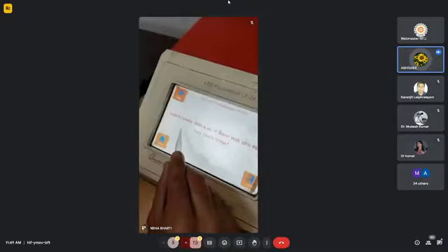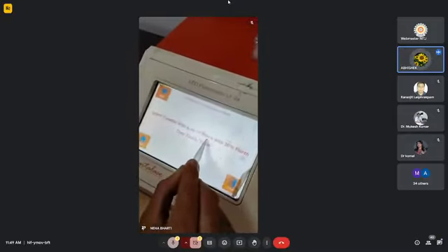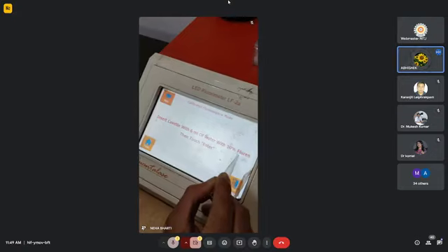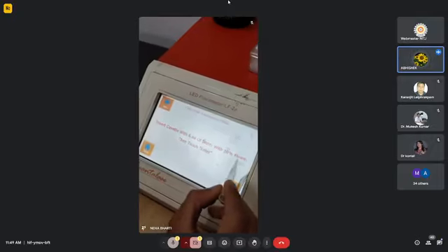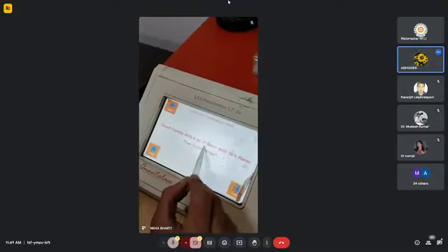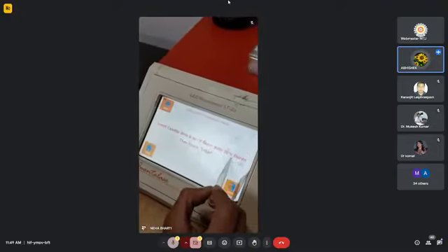Here it is asking to insert a cuvette of 6 ml of water. Water means distilled water, double distilled water with 10% buffer solution. This buffer solution is used while preparing the final sample for the measurements. So we have to add 6 ml of double distilled water with 10% of the buffer solution.